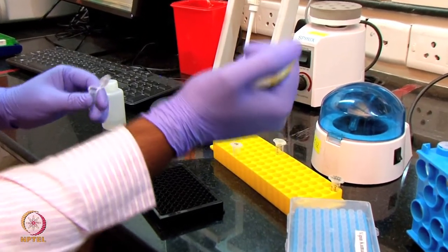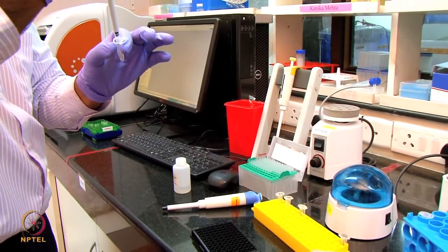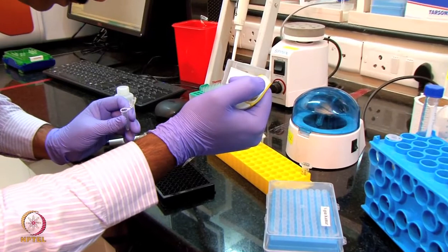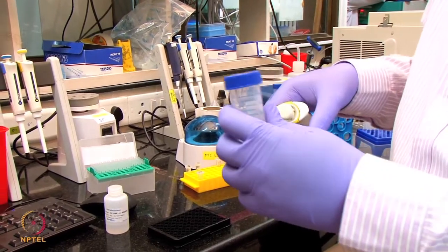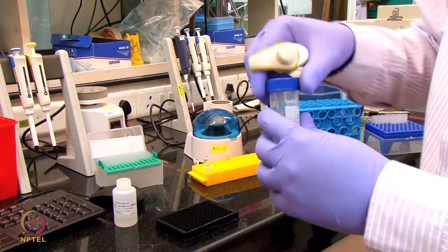This is sample number 2 at B4. The sample number 3 at B5. So there are 3 unknown samples. So I'm using the glycine buffer, that is a pH 2, 10 millimolar glycine buffer.